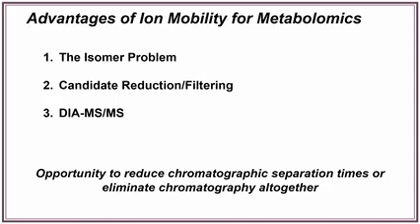And so the impact really is that you have an opportunity to reduce or potentially even eliminate the chromatographic separations, because it becomes less important to perfectly resolve every single analyte in your chromatogram. So we're going to talk a little bit about some examples that cover each of these.